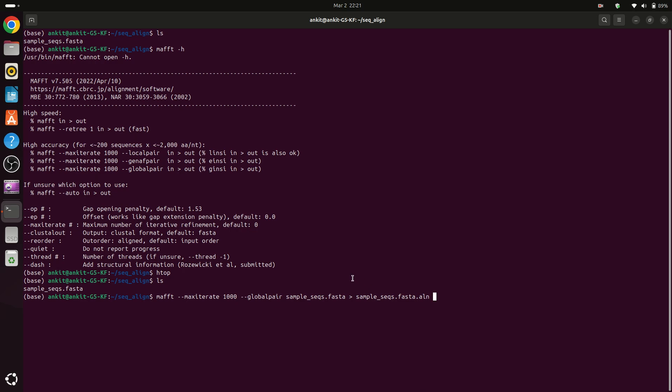But as I have 16 I can provide more. For example now I will provide here 12 threads, so I am typing here 12 to speed up my alignment.